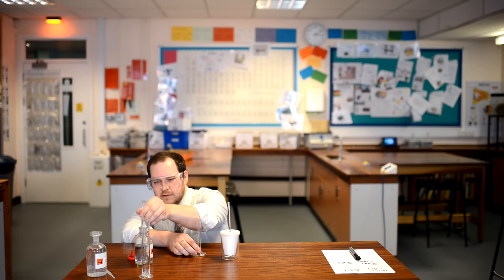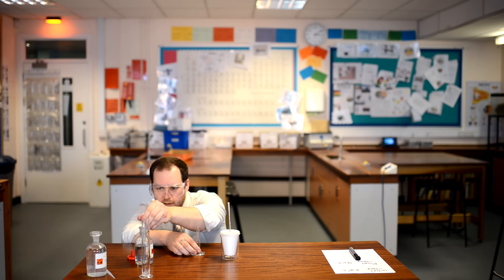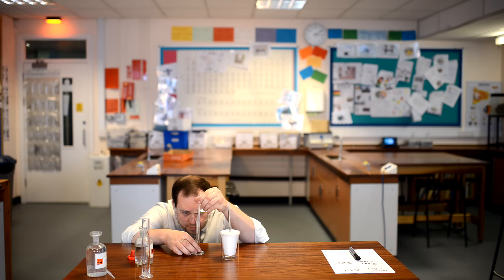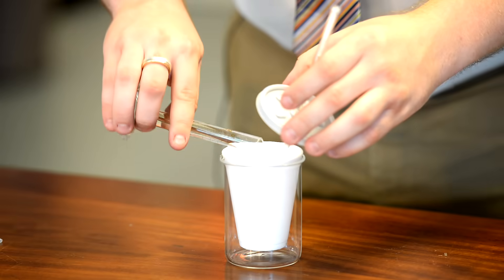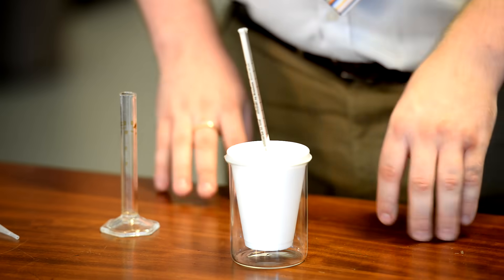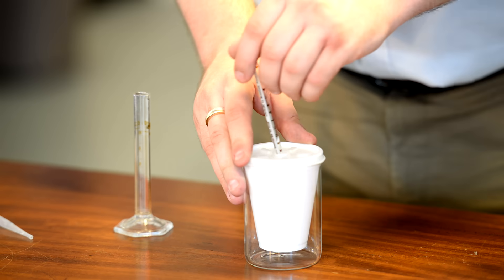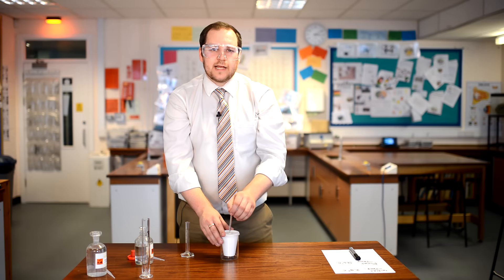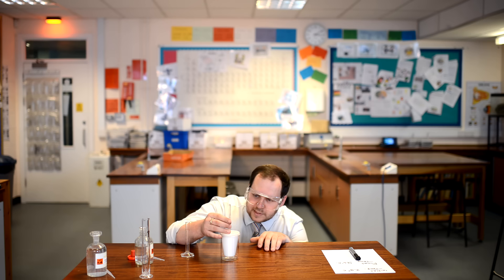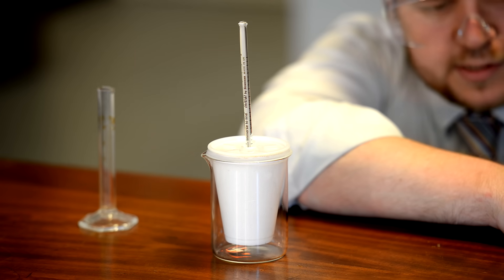Record each addition using a dropping pipette, measuring precisely and reading to the bottom of the meniscus. We've now got 30 centimetres cubed of hydrochloric acid and 10 centimetres cubed of sodium hydroxide. Stir to make sure the heat energy is spread as evenly as possible, then read the maximum temperature reached. Mine has now gone up to 27 degrees Celsius.